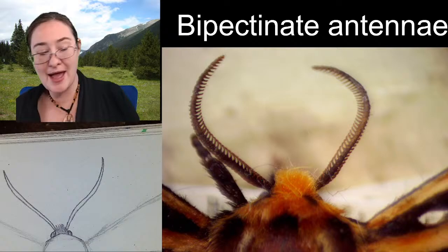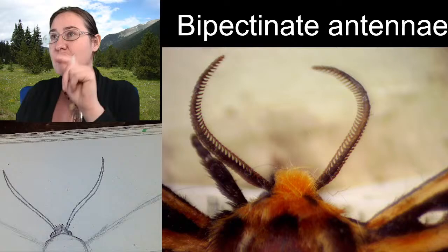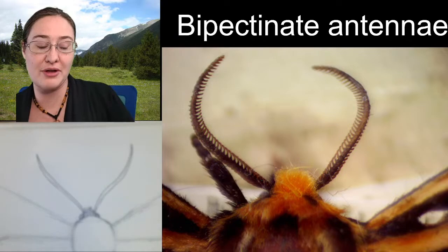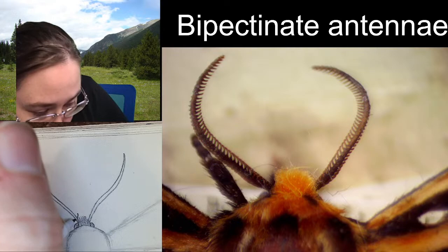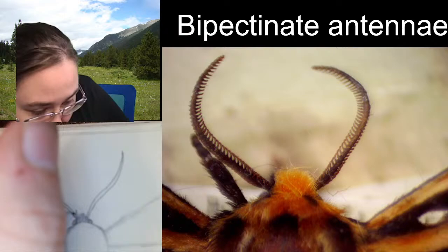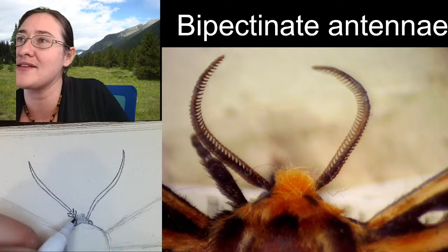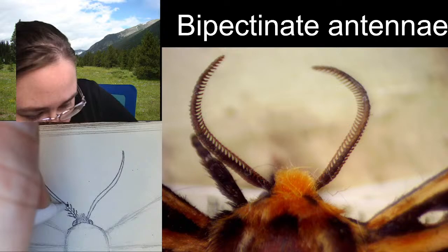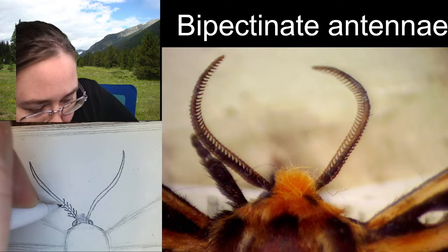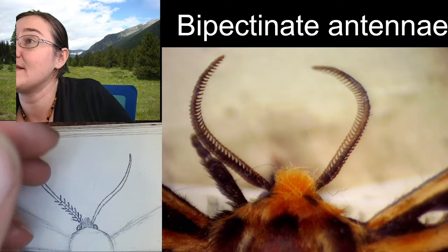So for every single segment of the antenna, it has another one of those pieces coming off. We don't really have time to go through and count all of those. We just know that there's a whole lot. So every time you have one piece that comes off this side, it needs to also have a matching piece coming off of the other side. And then there's a segment in the center of the antenna. So if you go through your antenna and add one piece on either side, and then add a segment to the center, that's going to give you your most realistic sketch of these antenna. Just make sure that they stay nice and short. It's been a long time since I've done one of these type of antenna, so hopefully it turns out pretty. Looks like I might need to double up.